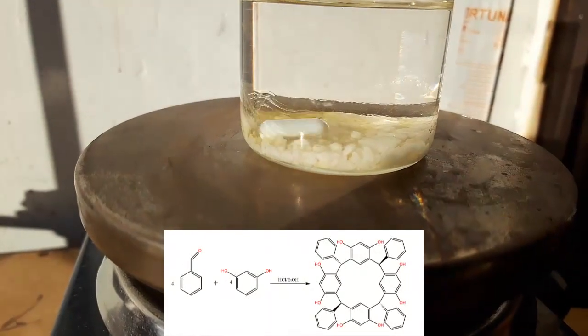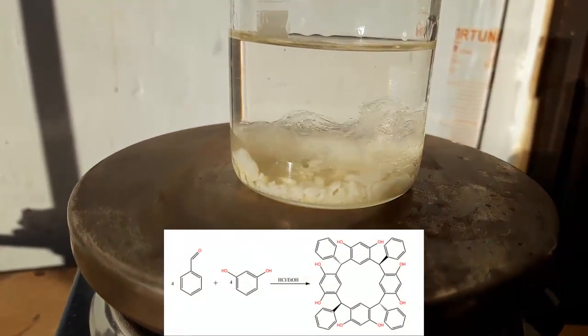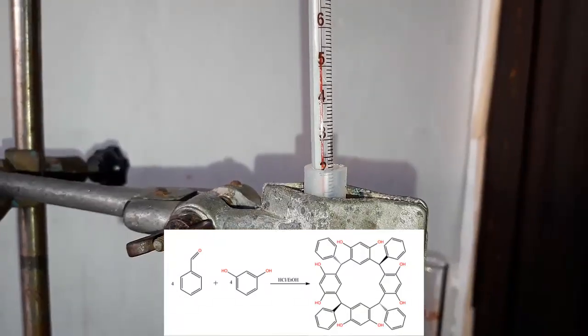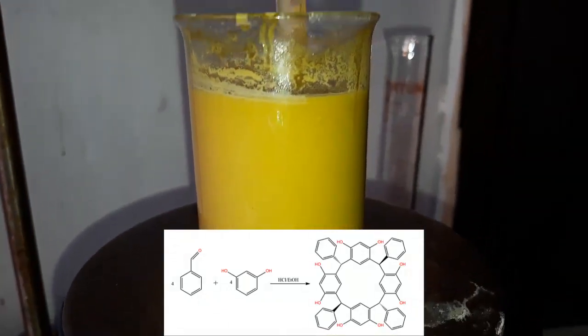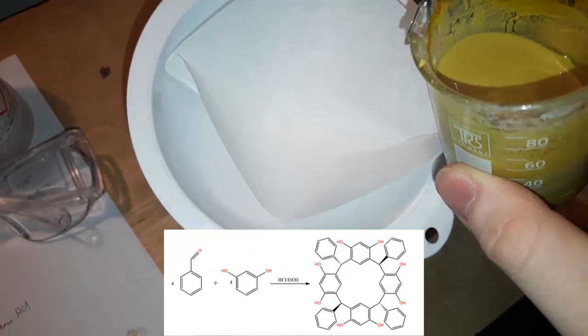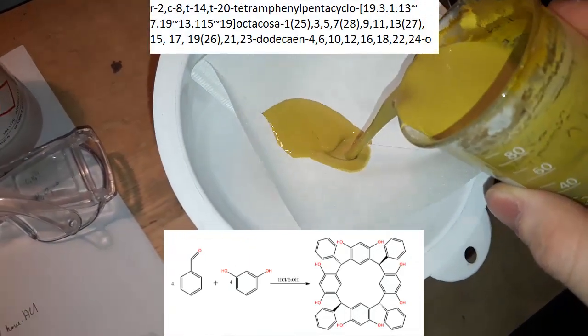Hello guys, welcome to a new series called 'Researching Resorcinol', where we'll be, like the name suggests, researching interesting reactions involving resorcinol and its products. In the first episode, we'll be making a beast of a molecule called this, or calix[4]resorcinol for short.